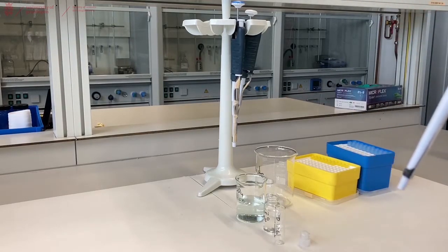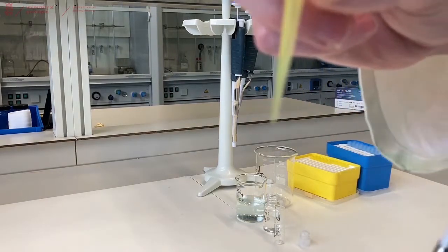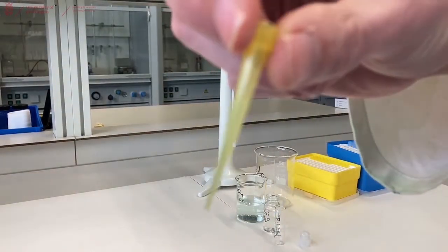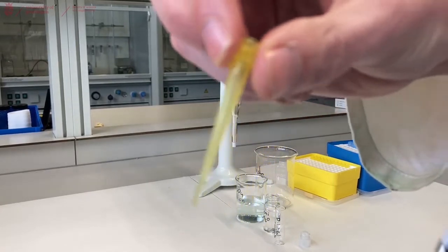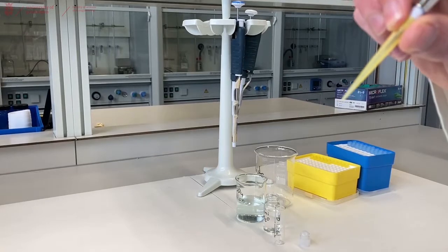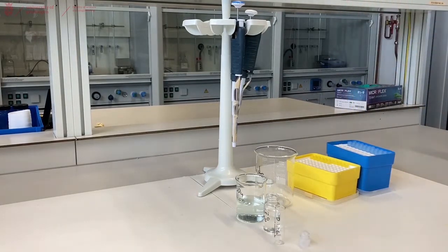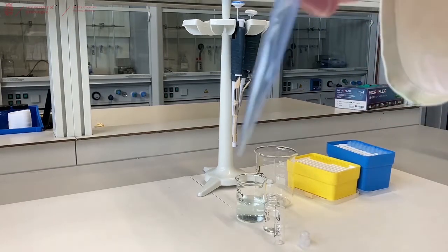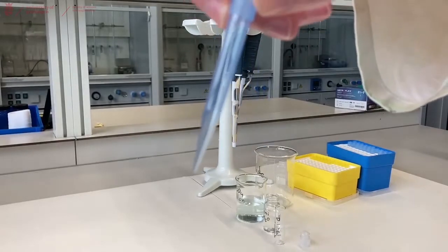Pipette tips come in different colors. The yellow pipette tips for this specific pipette are calibrated between 2 and 200 microliters, and you can attach them to the bottom of your pipette by putting the pipette into the box. The blue ones are calibrated from 200 to 1000 microliters and fit on the larger pipettes.